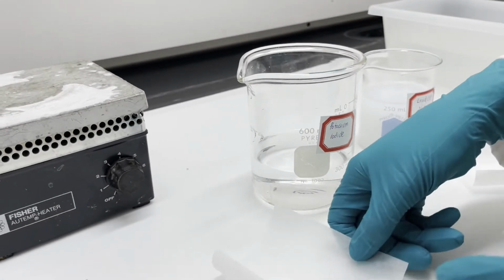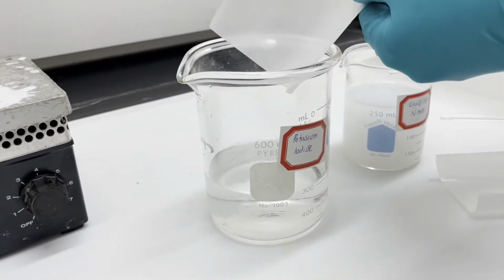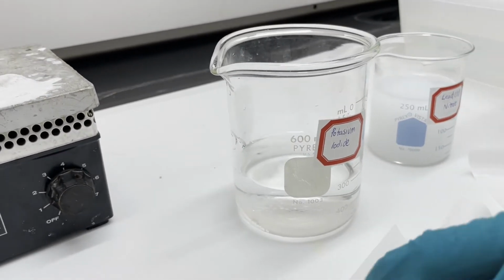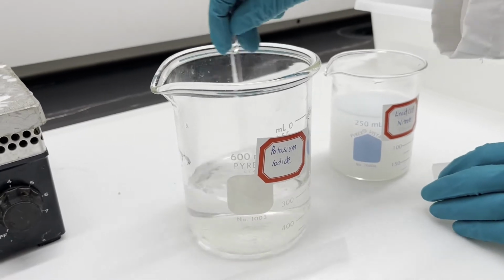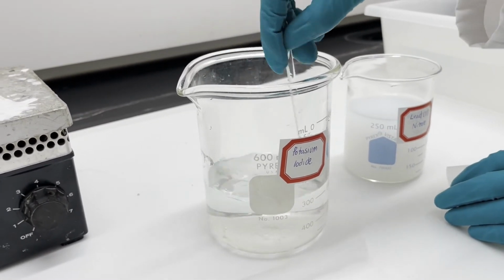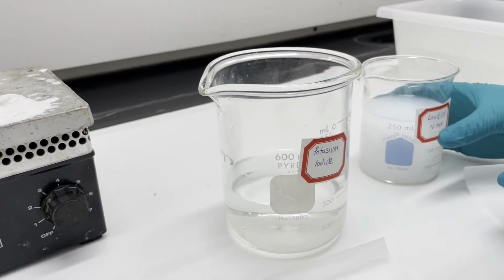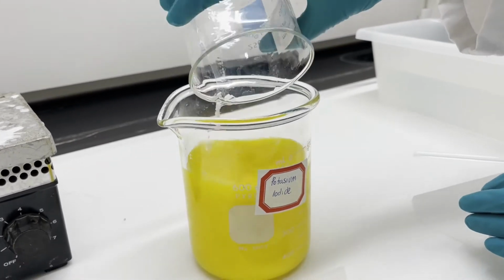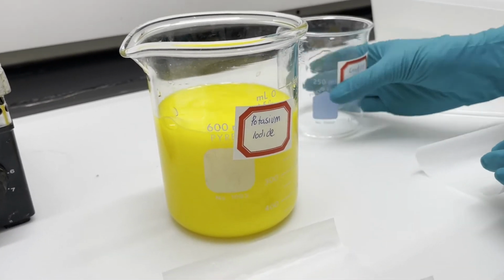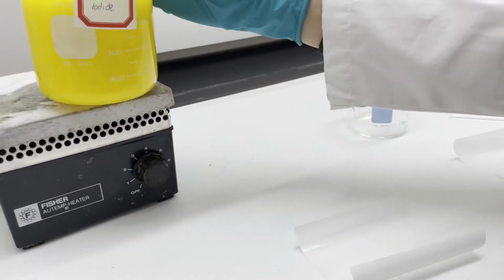Now I'm going to take the potassium iodide and dissolve it in some water as well. And once again, I'm just going to stir it to make sure it's evenly mixed. Now I'm going to mix the two solutions together. And as you can see, it instantaneously turned yellow. Now we are going to heat the solution.